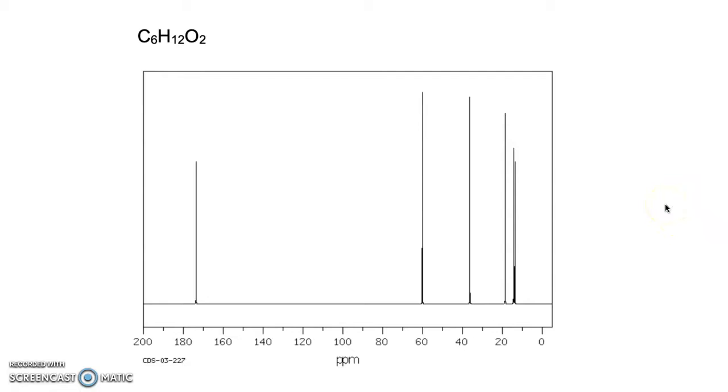Hello everyone, this is Rhyan Klima, and today we're going to look at a combined spectral problem, specifically looking at C6H12O2. As you can imagine, with a combined spectral problem, there is a lot to unpack here, so we're going to approach it with a step-by-step process.